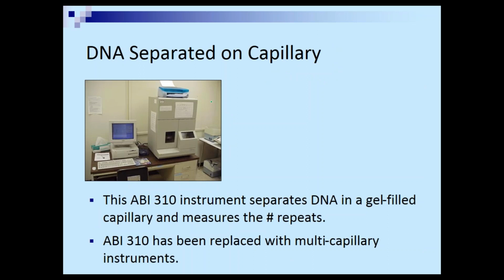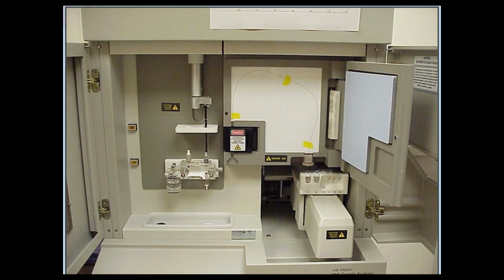You can also do this in a capillary instrument. The capillary instrument, this is what we have and actually are still using in our lab right now. We got some updated instrumentation that's not yet online. But if you open up this door, okay, this is what it looks like.